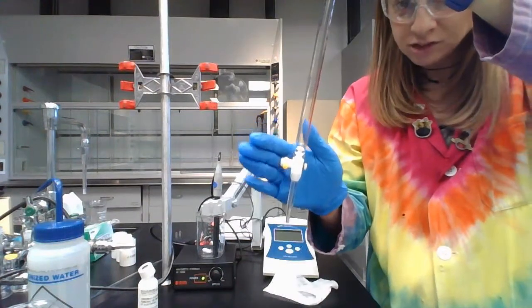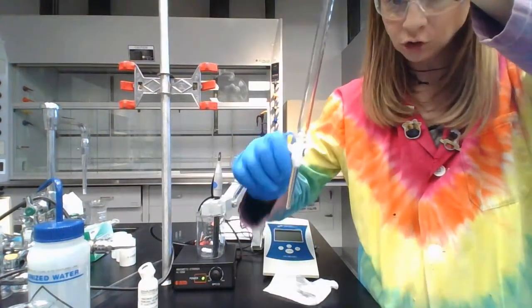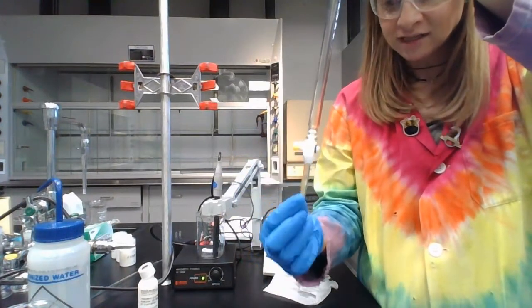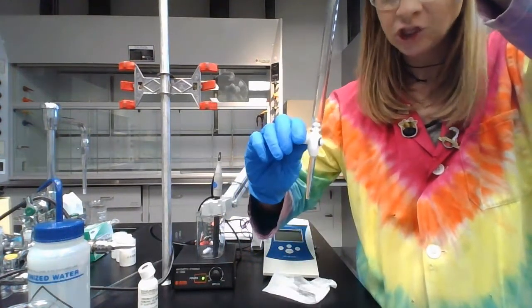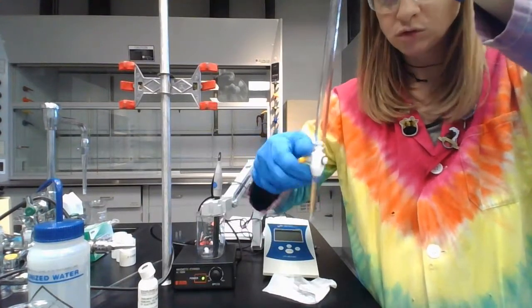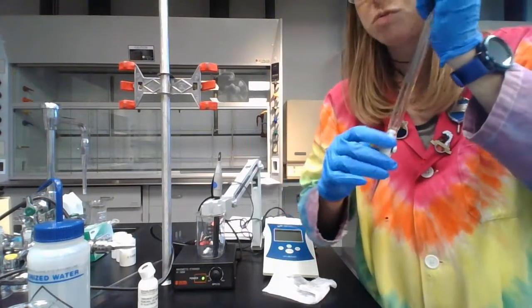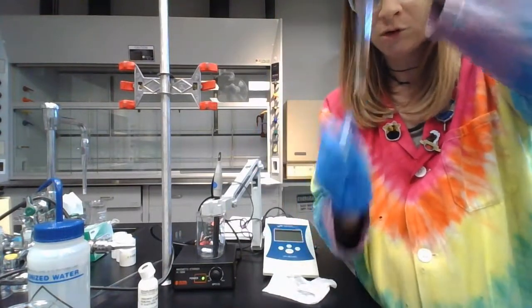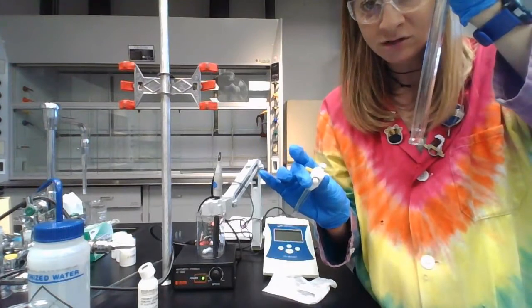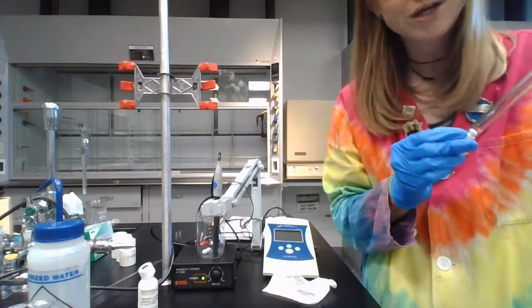Okay, so what I'm going to do is take the valve on the stopcock and do a quick 180-degree turn. What that does is it lets out a very small amount of liquid. It looks like it's more than a drop, but it's actually not, as long as you do it quickly enough. Then I can do that until I get the liquid to the level I need. Just be careful that you don't use all your strength and pull the tip and the stopcock out of the burette, because that's going to spill sodium hydroxide everywhere, and you get to start over. Plus, we get to clean all that up.